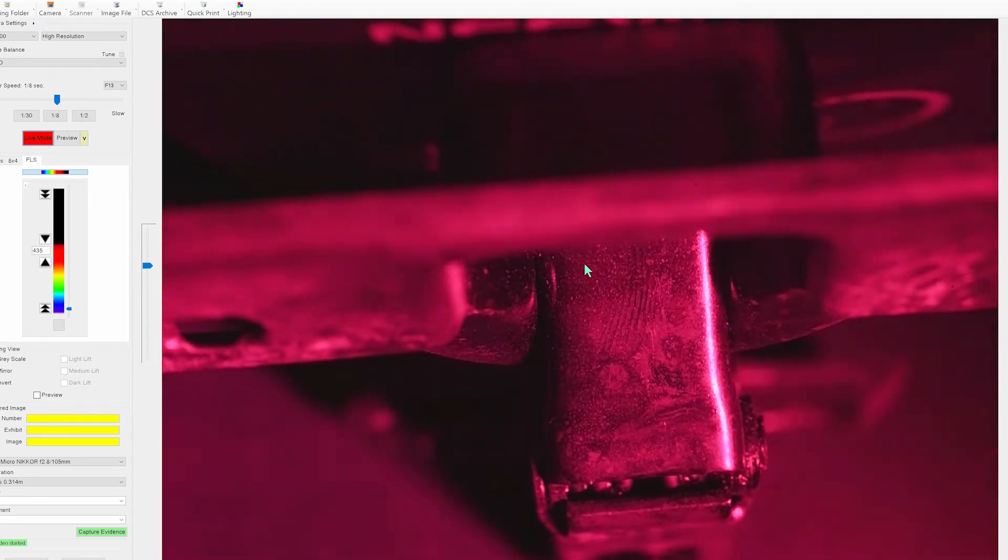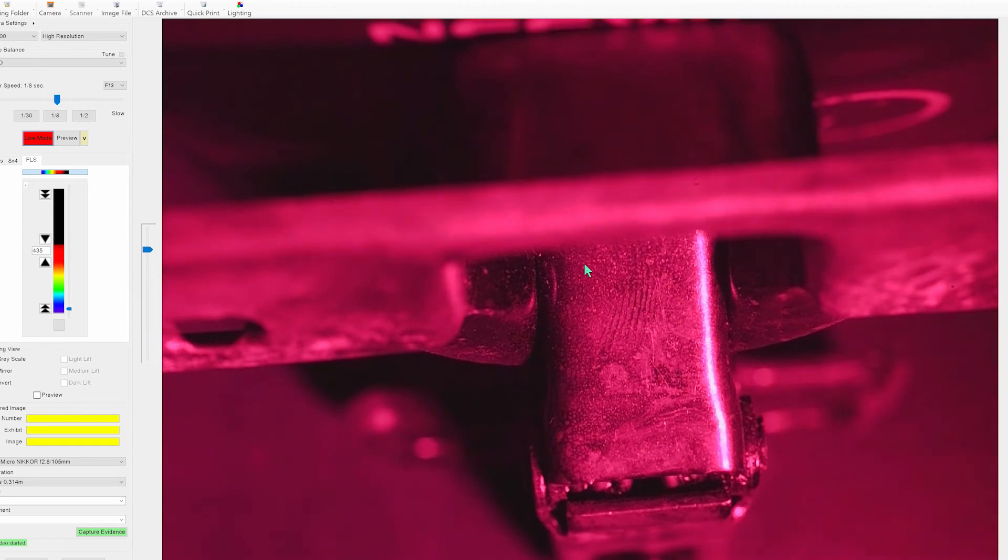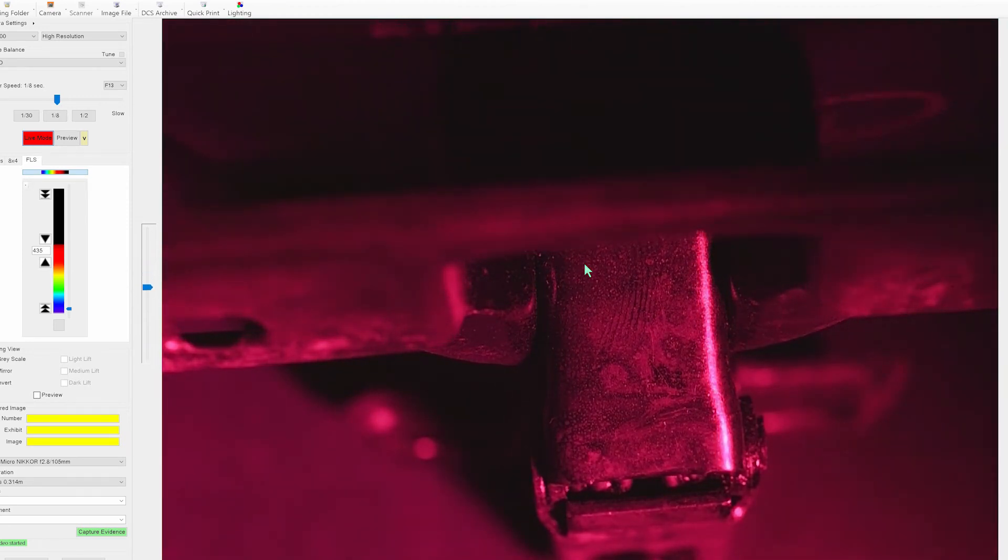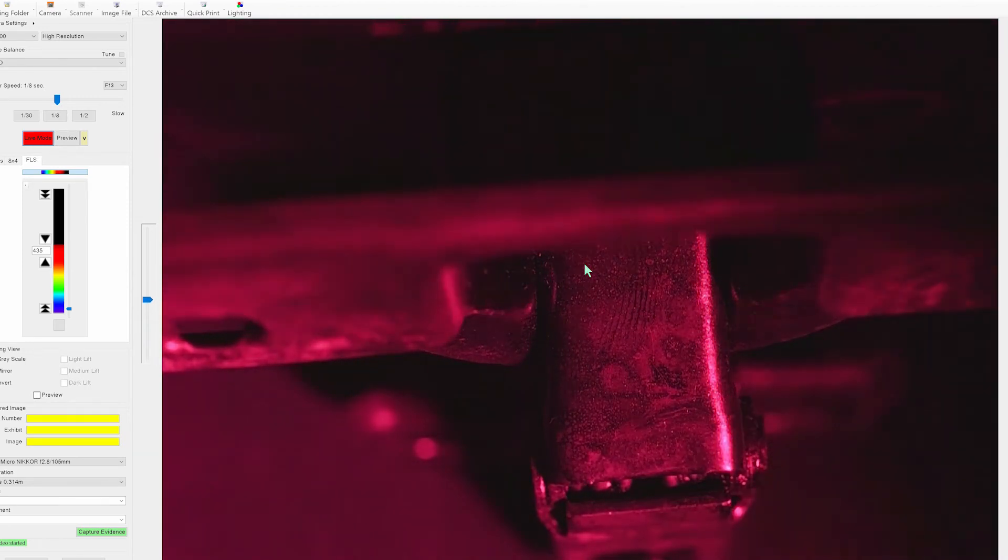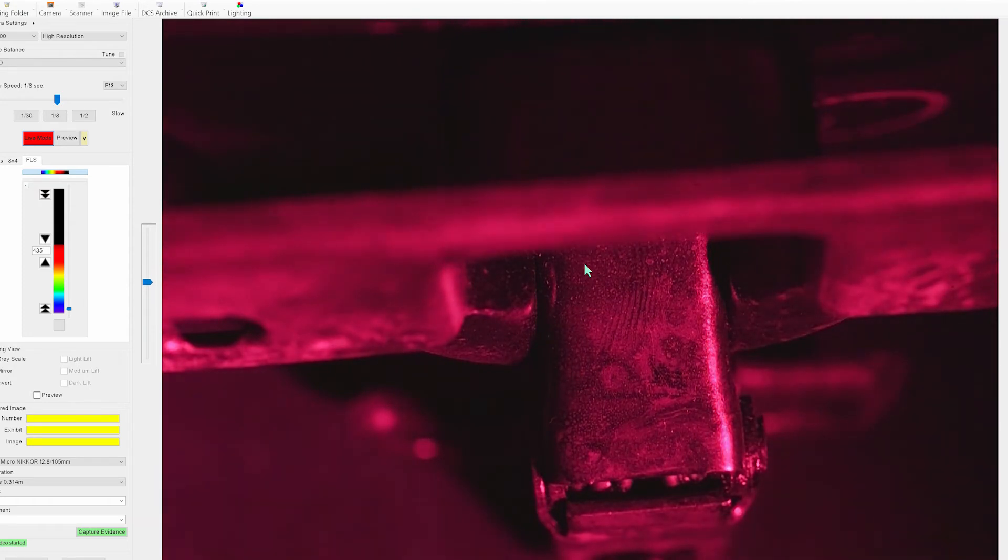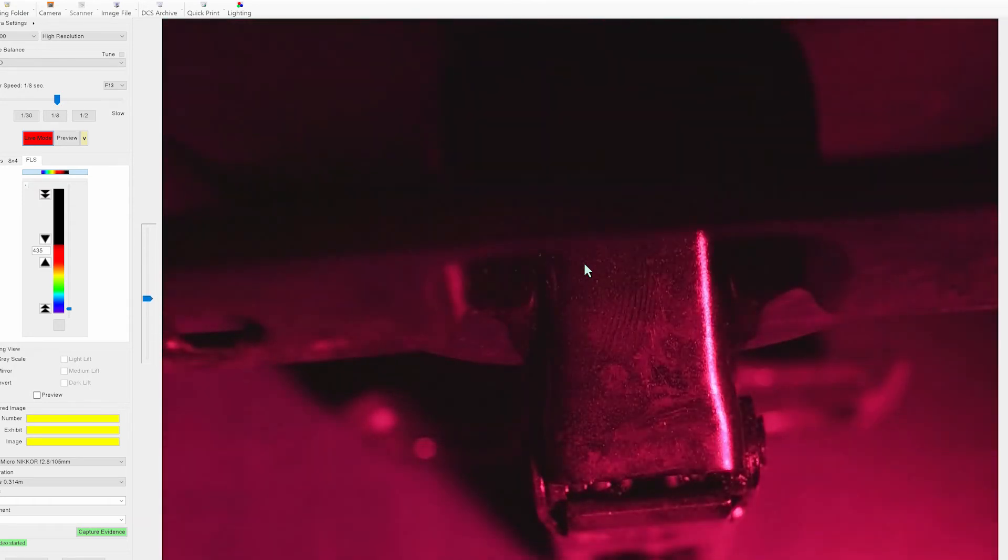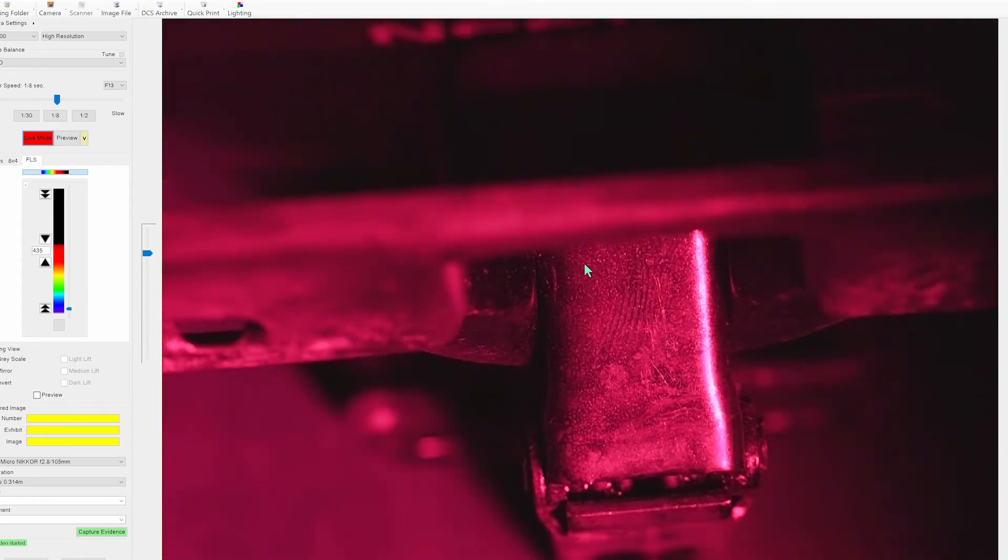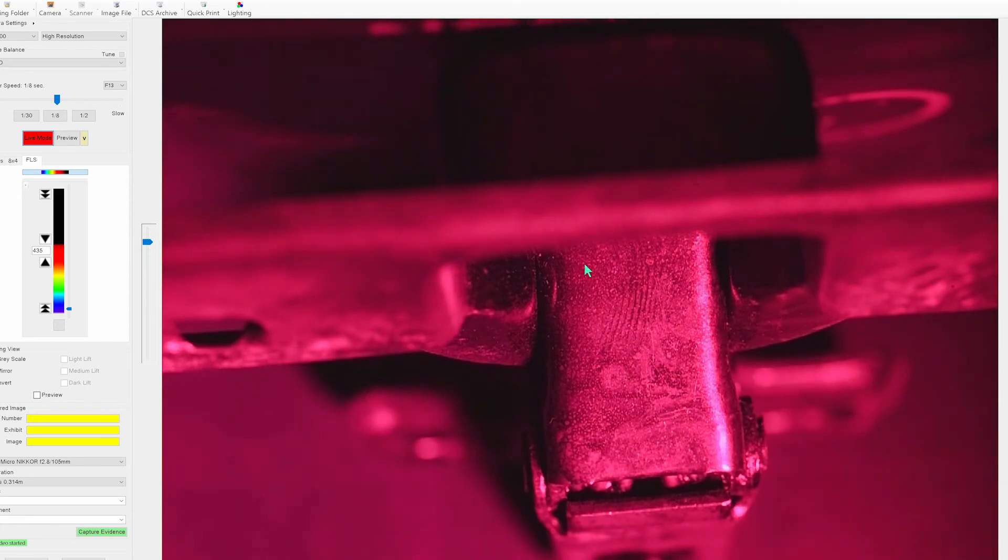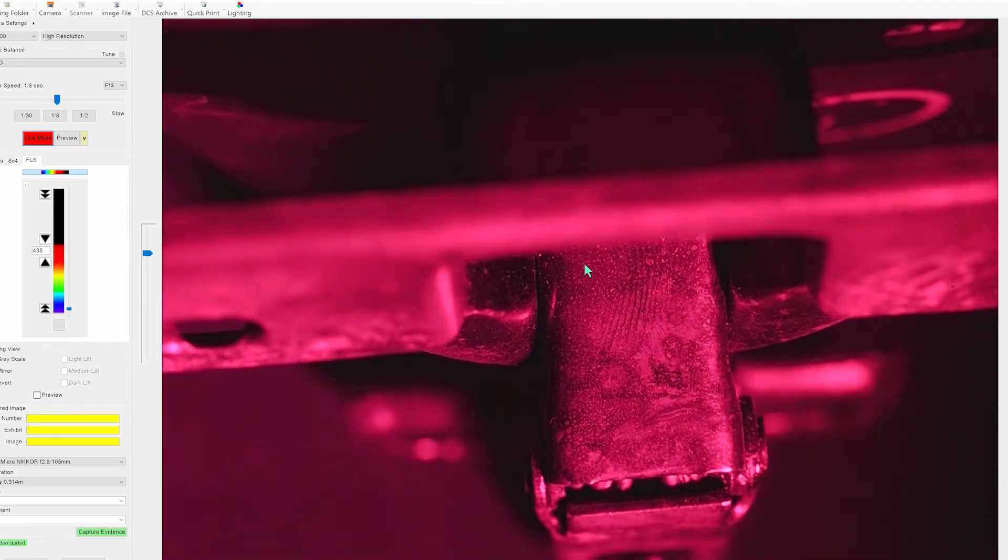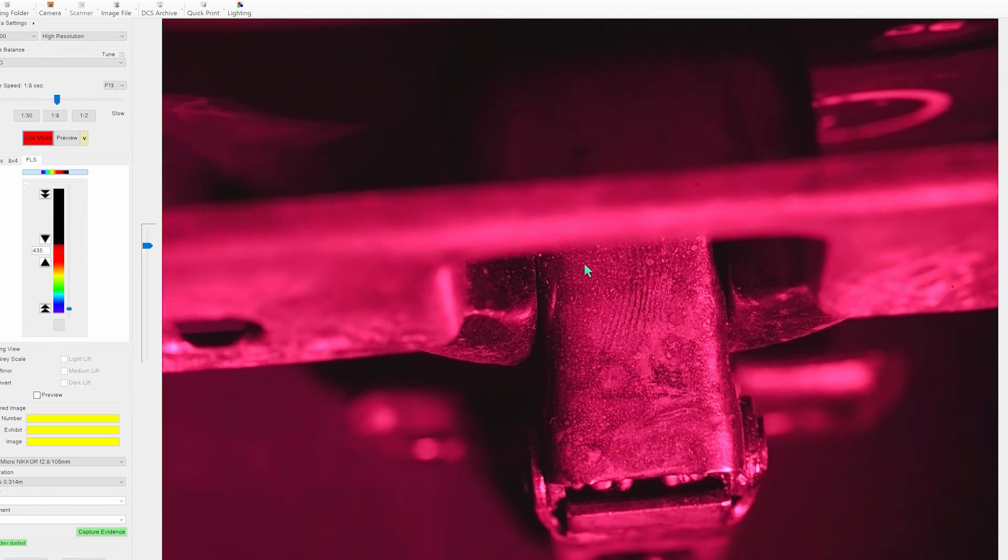Now here simply we're just using a special lens, a special bandpass filter, and a Crimelight 82S UV light source and here we can see on top of this piece of metal we can actually start to see a partial finger mark.